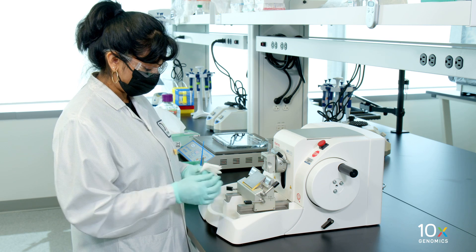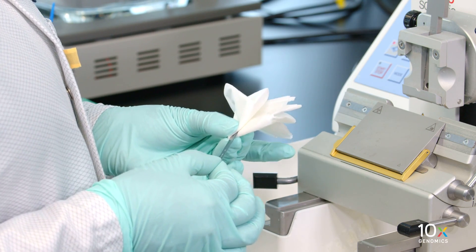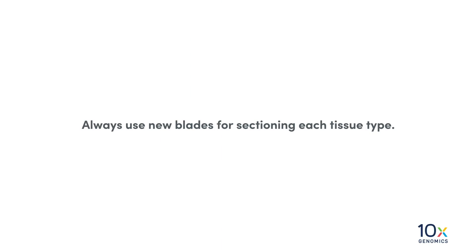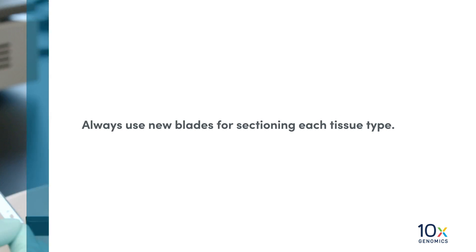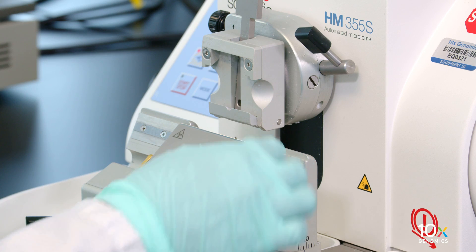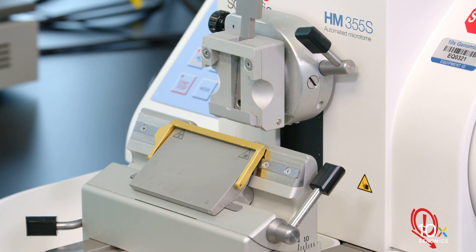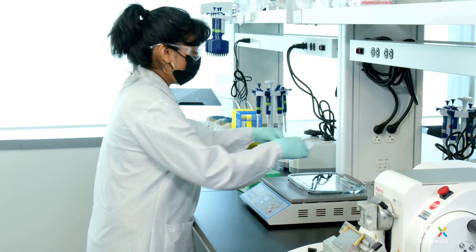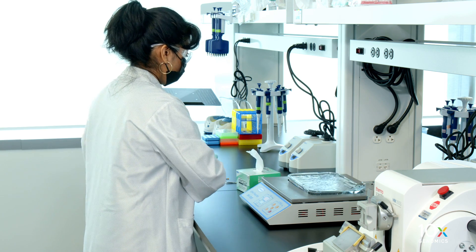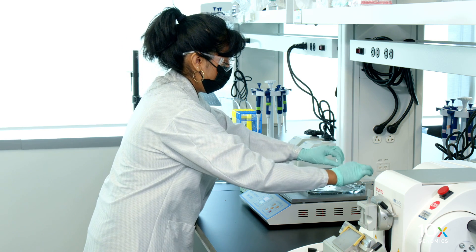Carefully wipe off the excess oils from a 35X ultra-disposable blade using a laboratory wipe with 100% ethanol. Let the ethanol evaporate before proceeding. Always use new blades for sectioning each tissue type. Secure the blade in the disposable blade holder of the microtome and place the knife guard over the blade to minimize the likelihood of injury. Ensure that the clearance angle is set to 10 degrees. Ensure that the water bath is set at 42 degrees Celsius and is free from bubbles and particulates by gliding a laboratory wipe over the water surface. Repeat this step between sectioning as necessary.